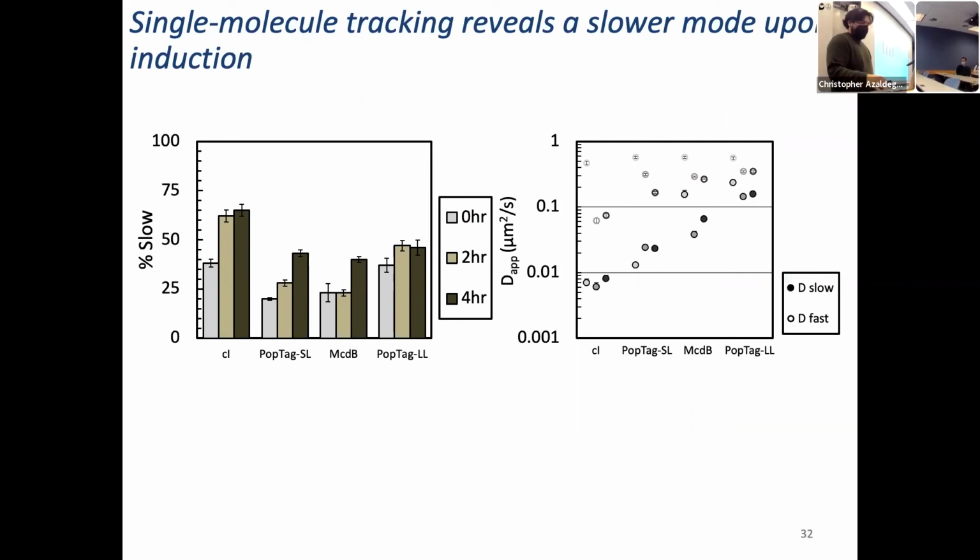So the initial motivation for choosing those values was just to get an idea of where the slow moving trajectories were localized inside of the cell. To encompass what generally was the slow population, regardless of the material state of our protein, I chose 0.05 because that seemed to be the mean of the upper end of our slow moving molecules. And 0.09 is usually on the lower end of what we would consider really diffusive proteins.